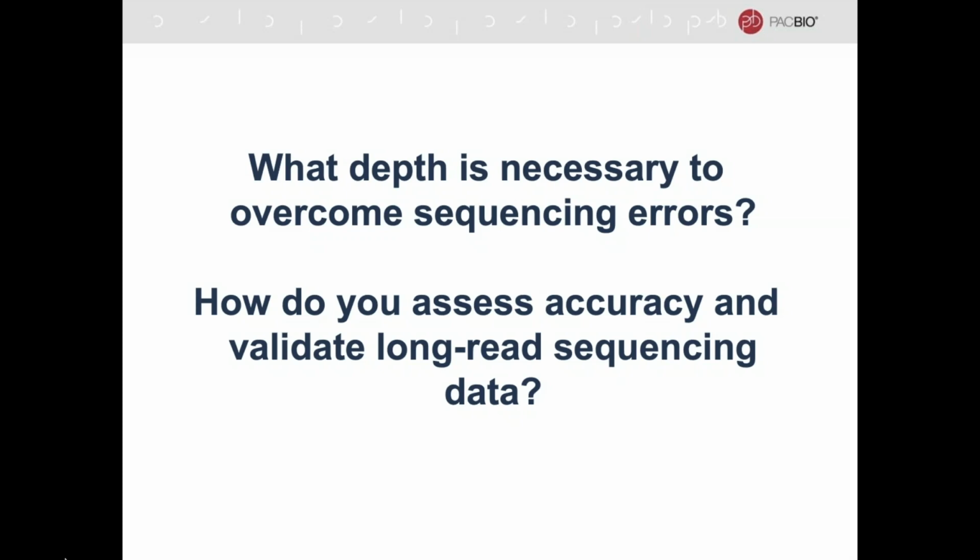But we actually haven't gone too far in that direction yet, to the point where I can say this is how much it's affecting the results of our assembly. Downstream, we're really focusing on the things that you brought up during your talk, as far as looking at coverage, completeness, and correctness. We've seen significant improvements going from short read data to PacBio data as far as assembly completeness.